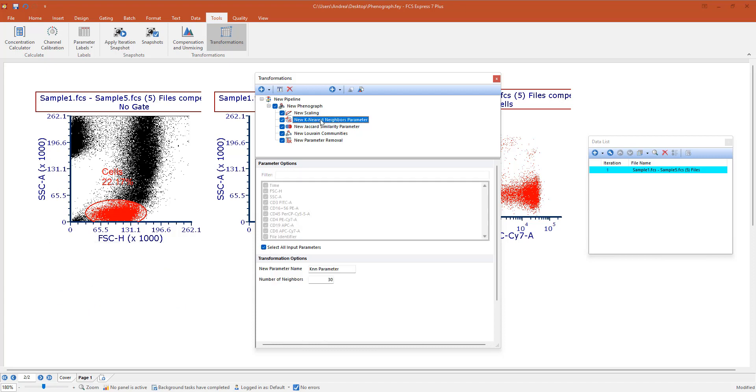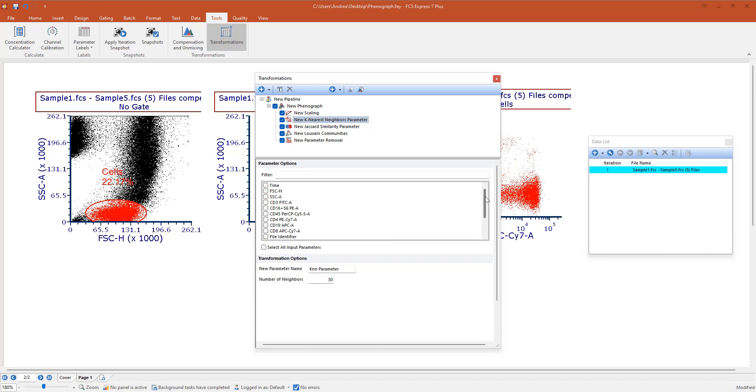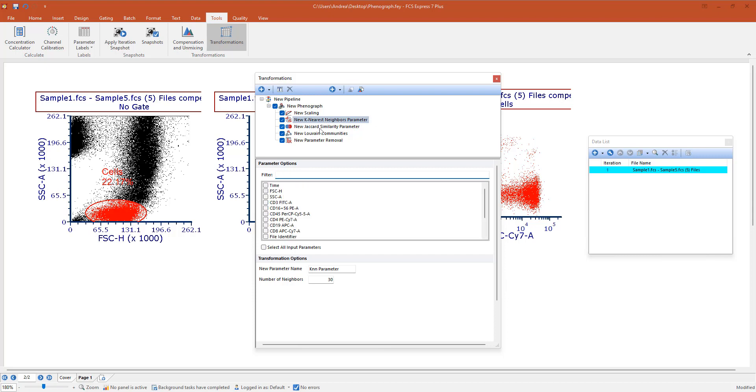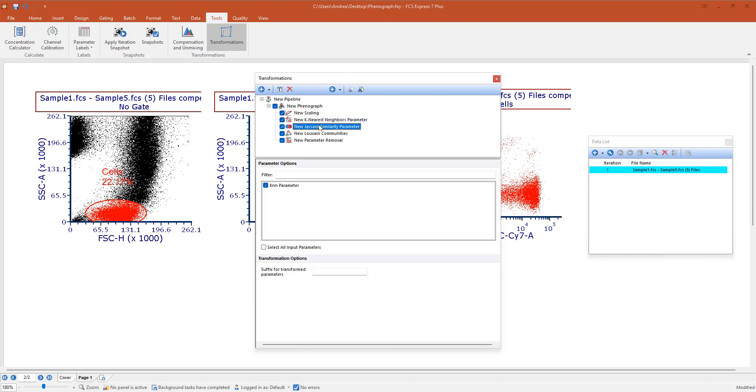The K nearest neighbor pipeline step will be run on the scaled parameters, so I'm going to deselect all of them and then instead of manually selecting the scaled parameters, I can still use the filter and do a select all. Then we have a Jaccard similarity parameter.